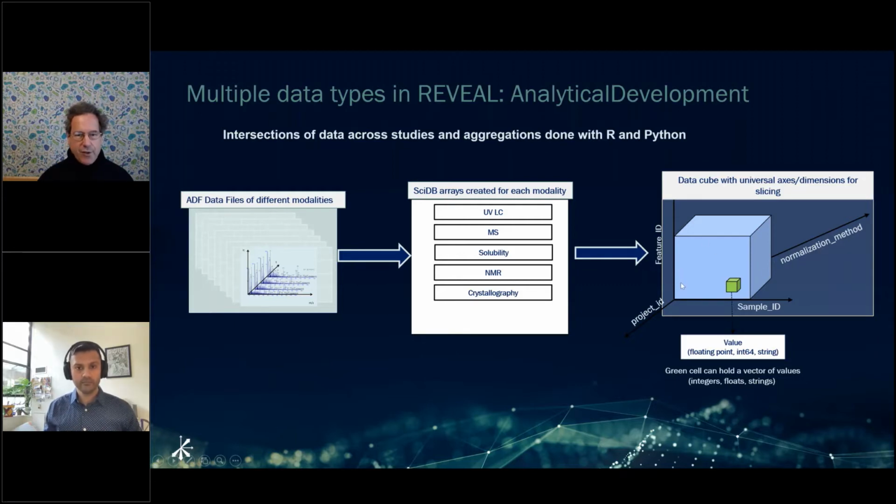So these axes, of course, would get created for the particular project, but they're generic in the sense that you are able to grab hypercubes of data that you would normally try to pull out individually from all of these different files.